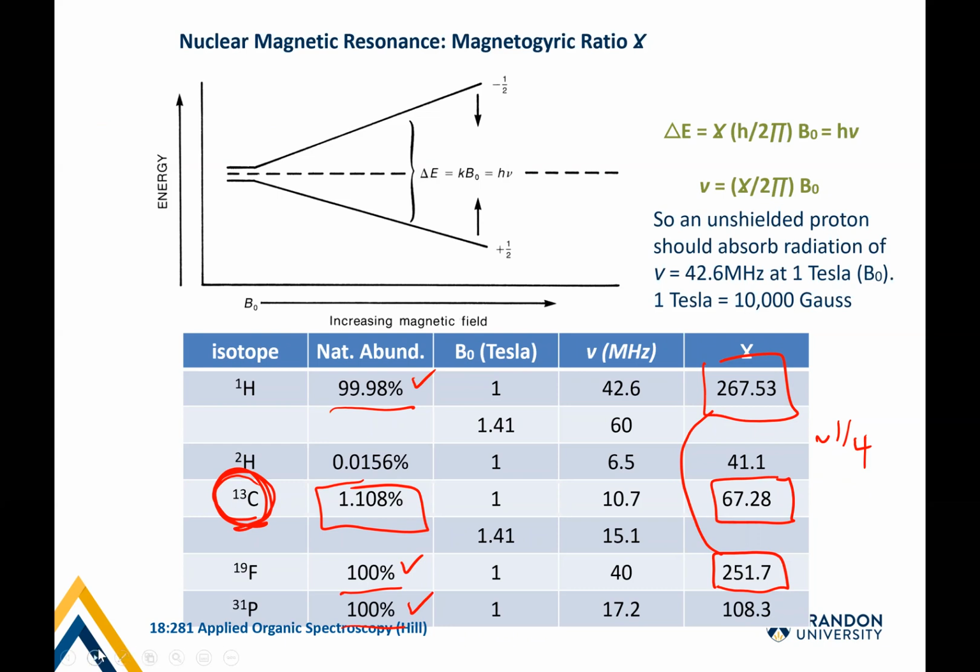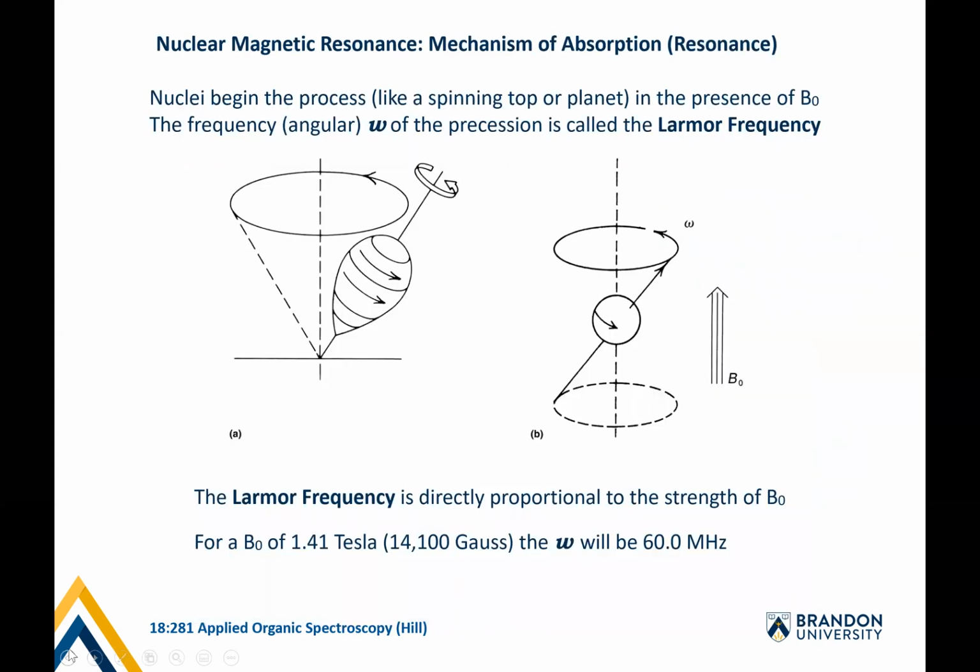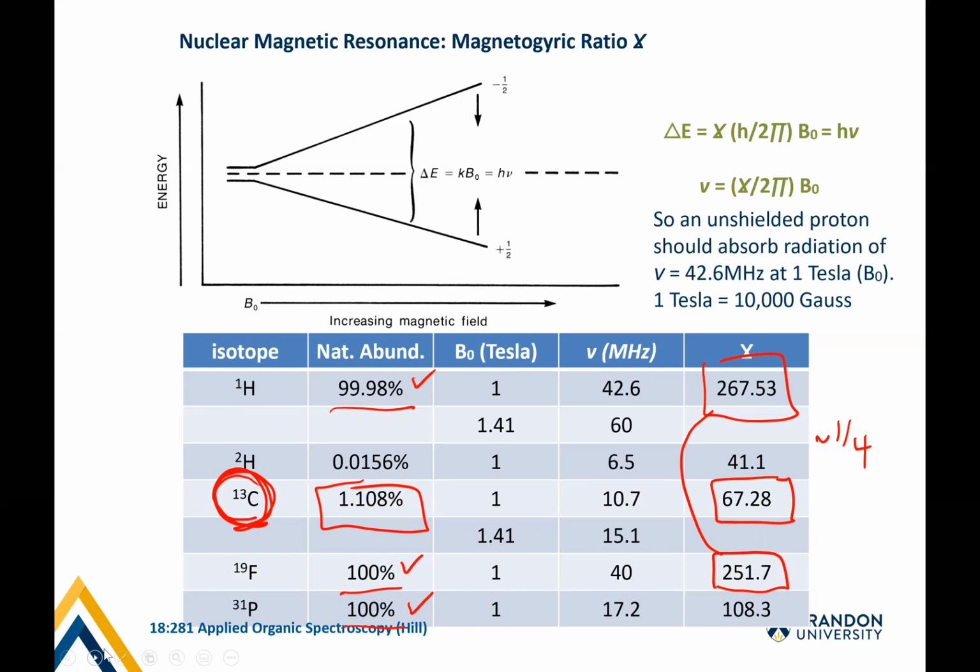Yeah, before we get into all of the rest of it, we'll probably stop here. This is basically the field strength, this is what that means. And they're comparing apples to apples here by putting these all at 1 or 1.4.